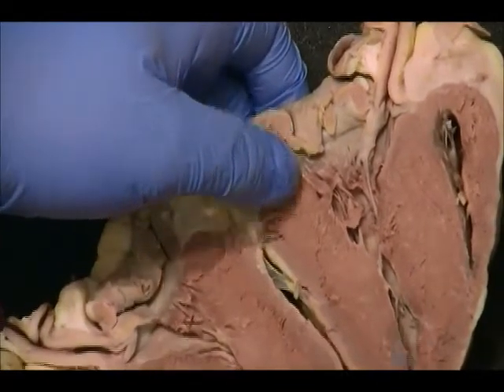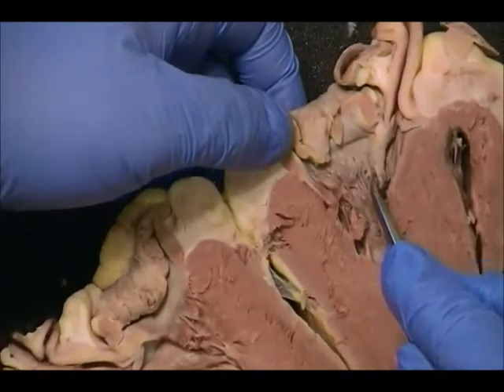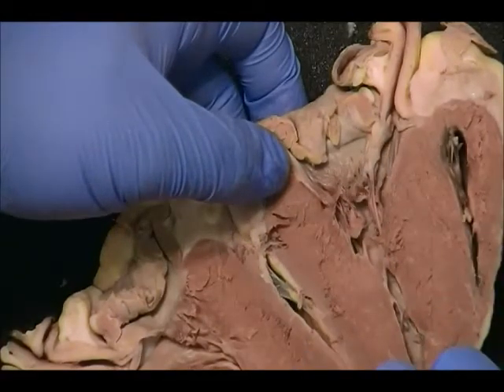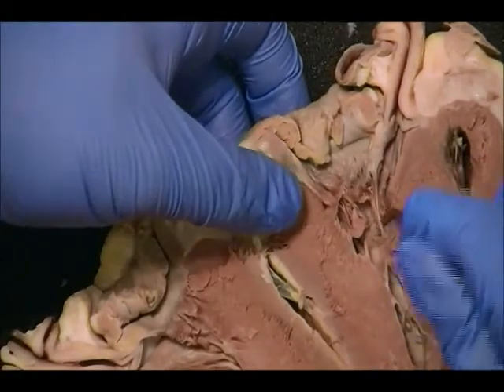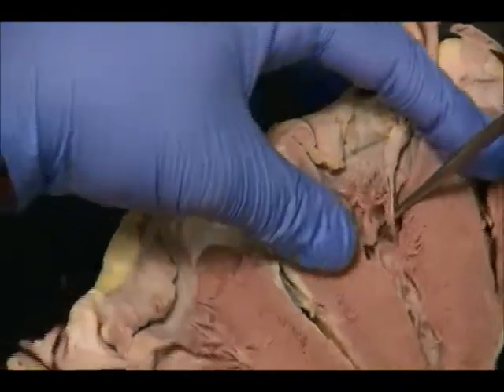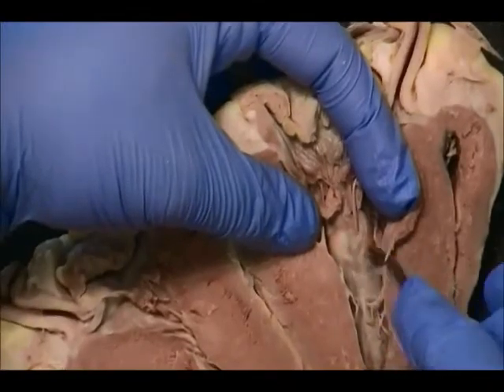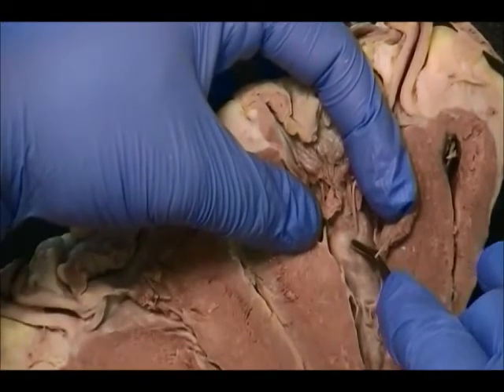And the cusps of the valves would be here. These would be the cusps of the valves. The papillary muscle, which is what the chordae tendineae is attached to, this would be the papillary muscle that it's attached to.